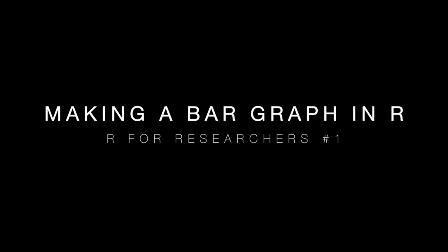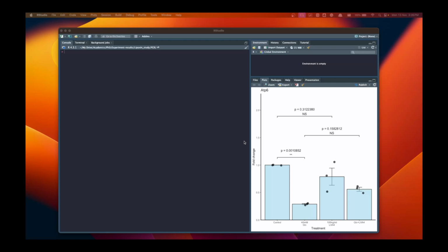So in this series of videos, we are going to look at how we can use R to reorganize an experimental data set that we obtained from a quantitative real-time PCR experiment and make a graph like this by writing some codes in R. We're also going to perform some statistical analysis and try to put the error bars, significance values, and the data points as you can see over here. So without further ado, let's get started.